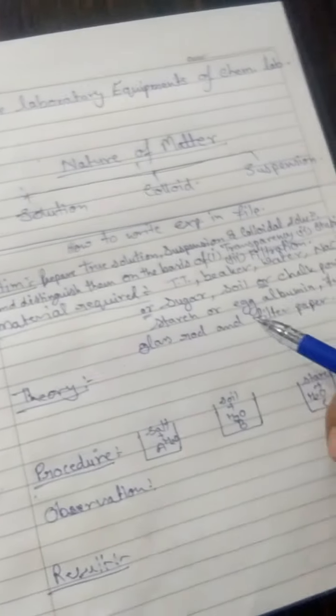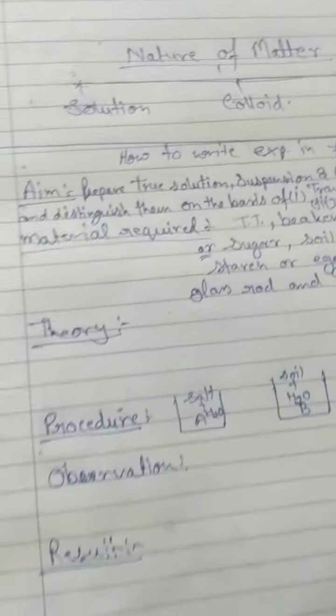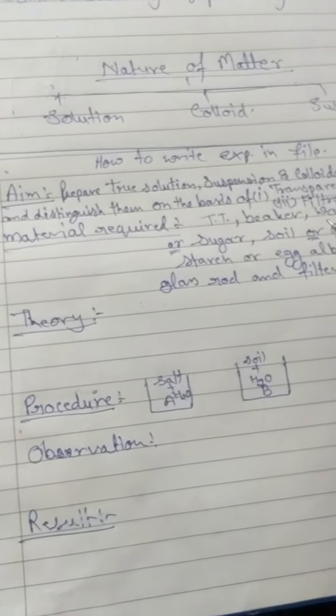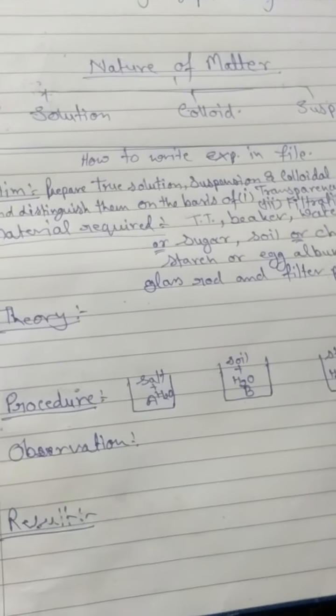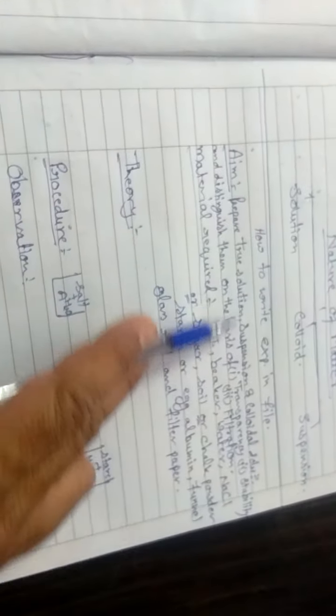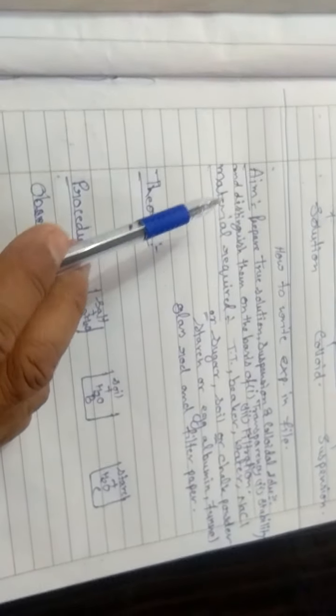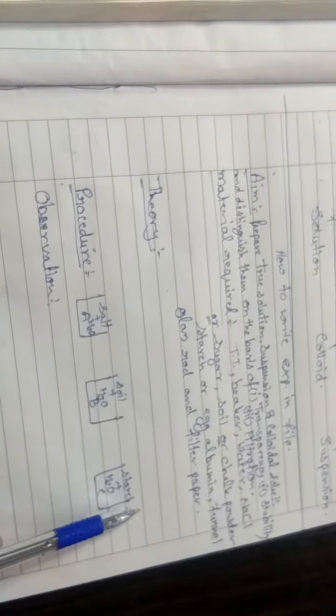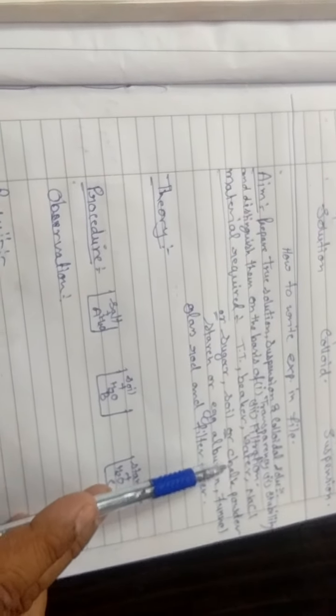Hello students, this is the second part of my video in which we see how to write the experiment in your file. The aim is given: prepare true solutions, suspension and colloidal solutions and distinguish them on the basis of transparency, stability and filtration criteria.